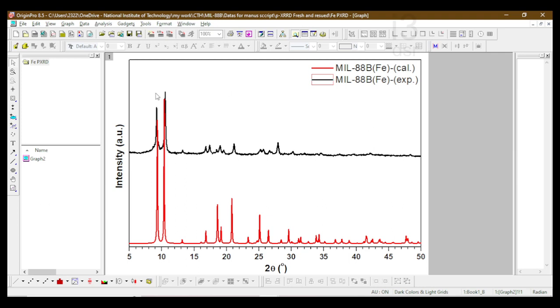So we'll have to plot this data. The black line is the experimental data given here, which is the MOF synthesized and then measured. It is not so easy to get such data. When I plot a graph, you would know from the operator, the data you get is not as clean as this. We will have to do analysis of this. That is where the problem lies.